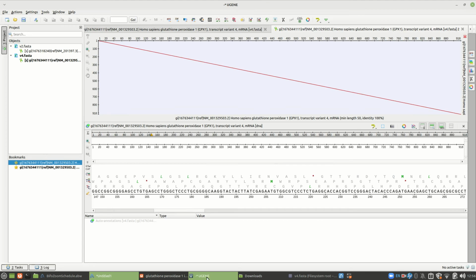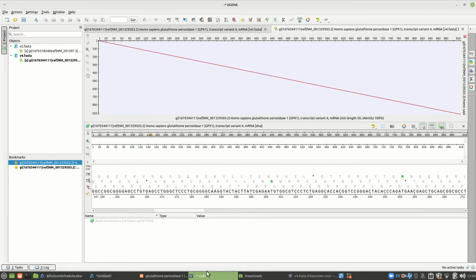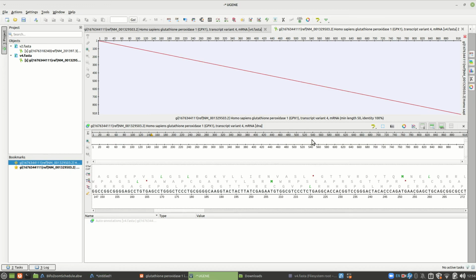So let's go back to Eugene. Let's go to this one. No, this is not the sequence that we get. All right, but now that we know this one, you can actually go find the correct answer. But you have to logically tell me why you chose some of these things. And telling me, well, that's what it said, usually doesn't cut it. But you can cheat and find the right answer here.